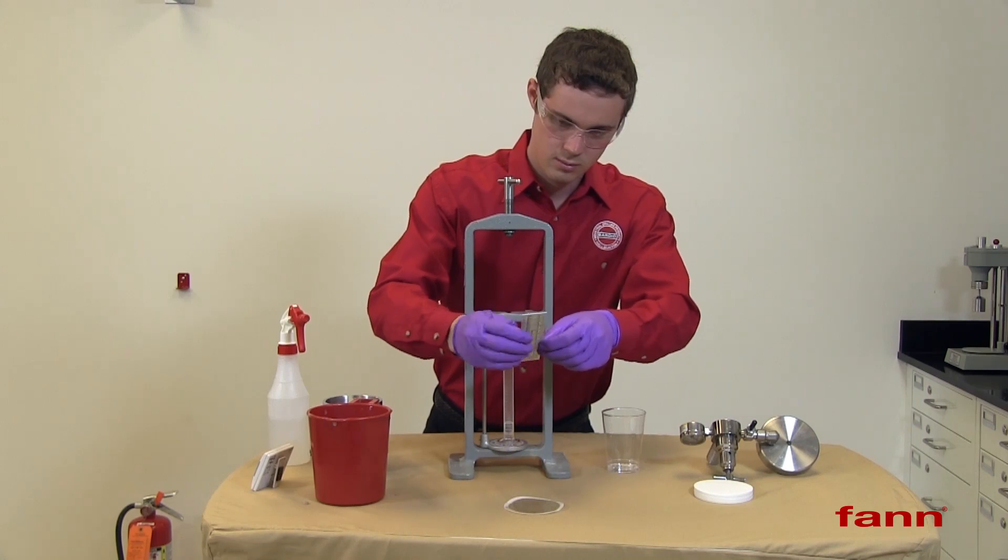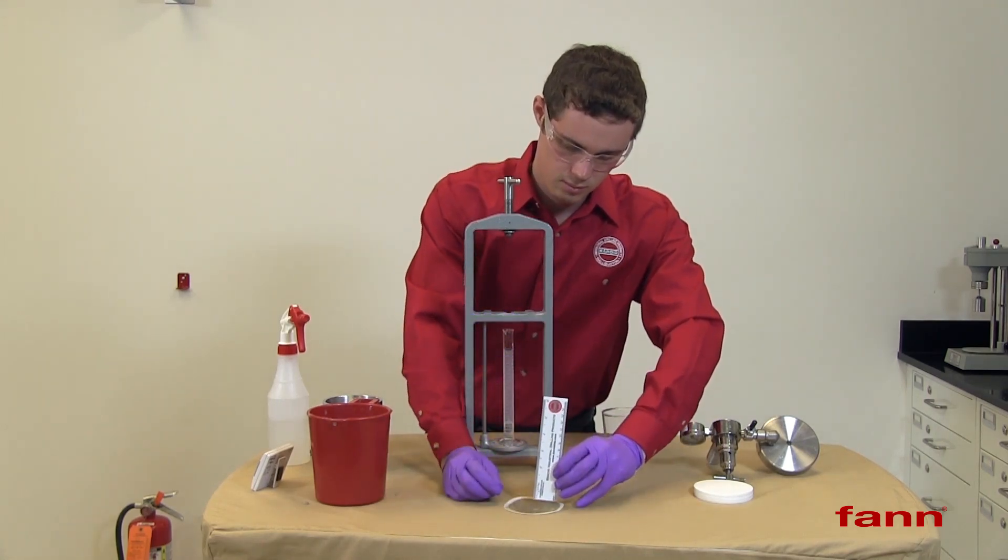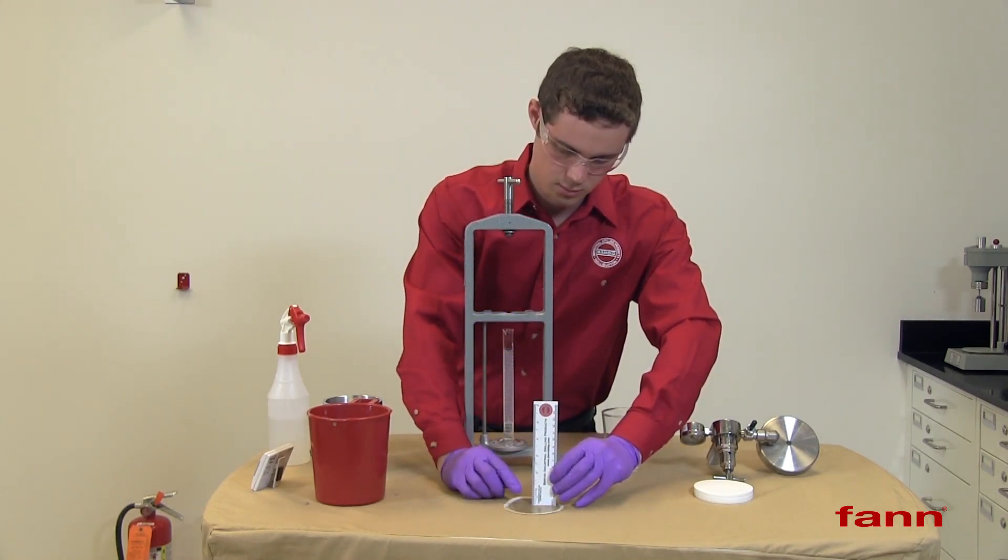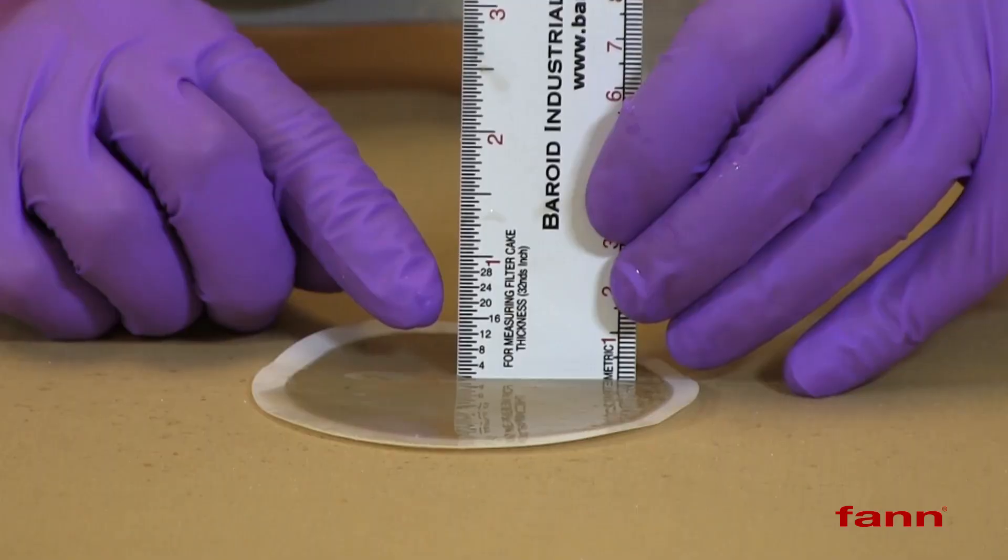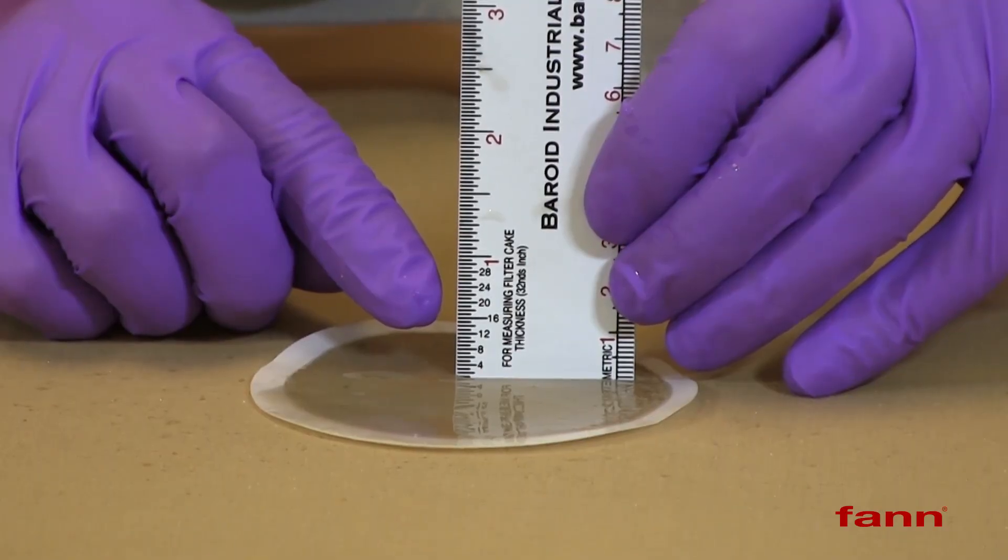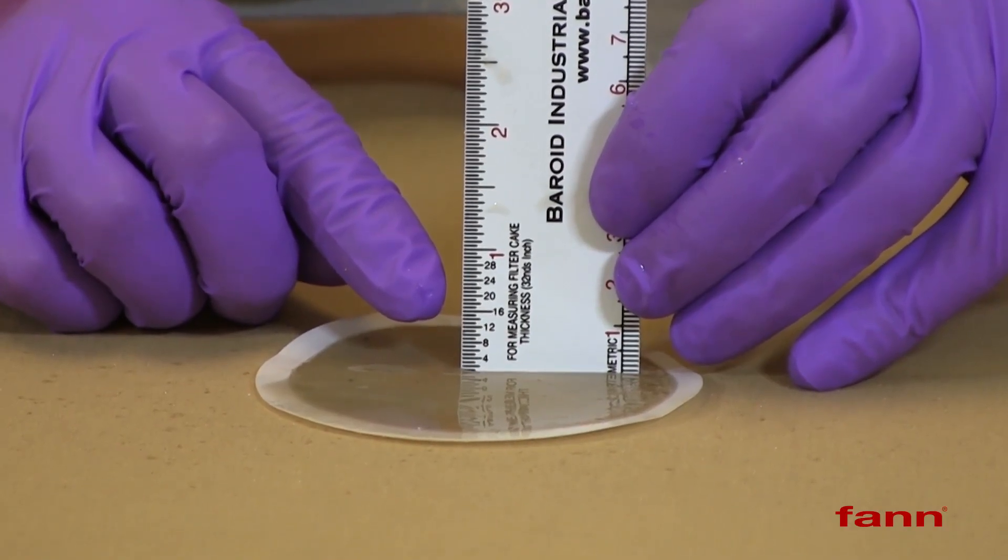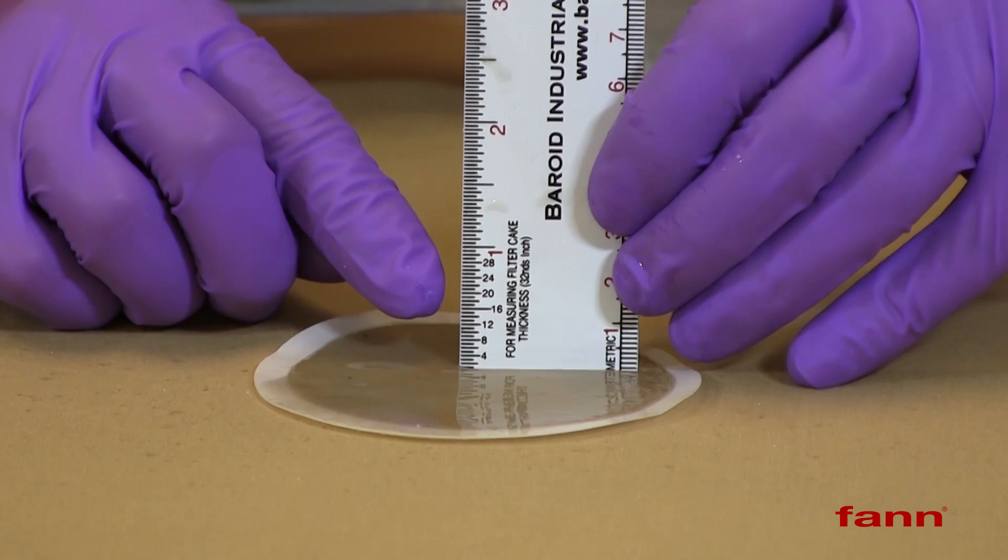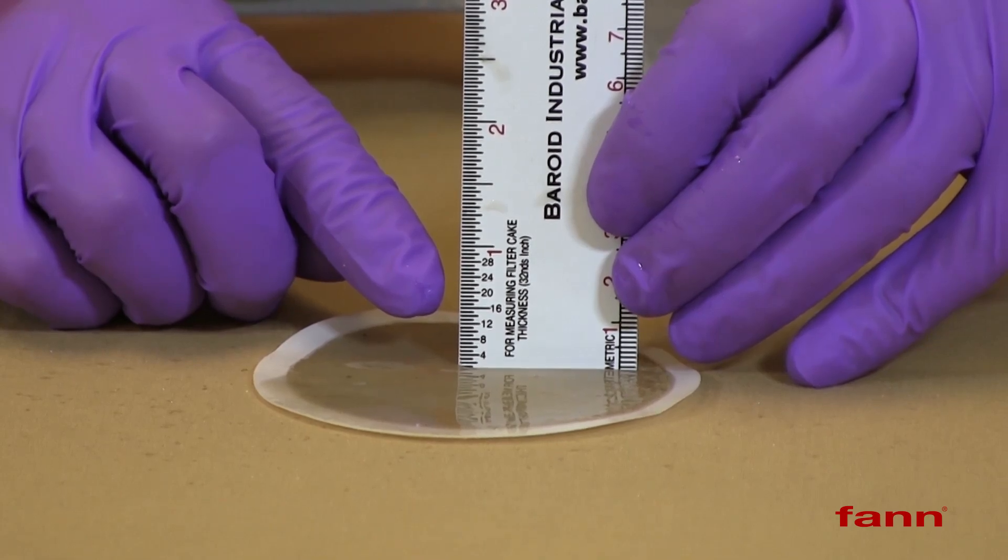Measure the thickness of the filter cake by placing a ruler in the cake and measuring the thickness to the nearest 32nd of an inch or the nearest millimeter. This filter cake is 1/32nd of an inch thick.